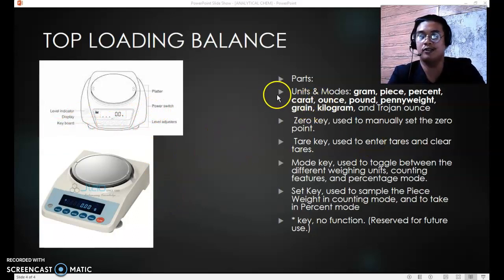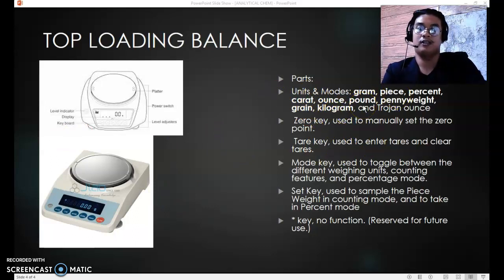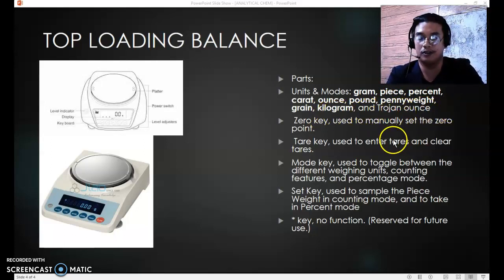So here I have the parts. First is the units and modes. It is in gram, piece, percent, carat, ounce, pound, pennyweight, grain, kilogram, and trojan ounce.